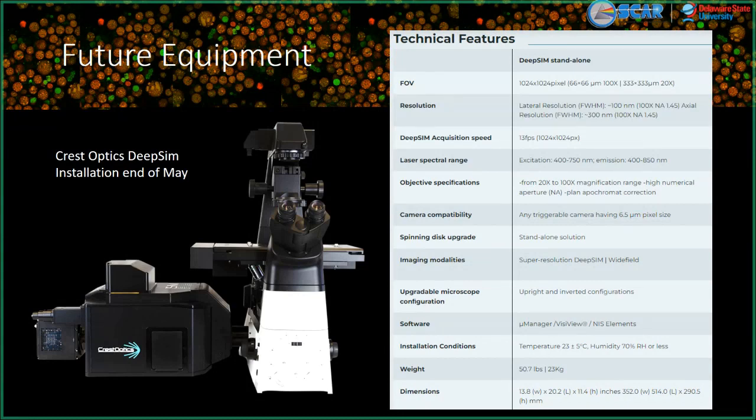And so this is still a diffraction limited system, except you're modulating the light with a grid pattern or with a micro lens array. In the case of this newer technology, using micro lenses, these micro lenses are able to create a micro lens mask. You can think of it kind of like a square with a bunch of little dots in it, and all those dots are illuminated.